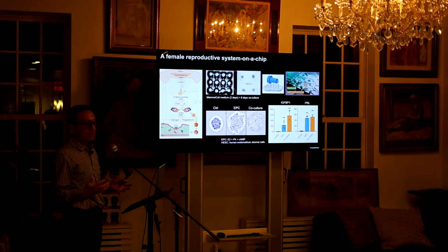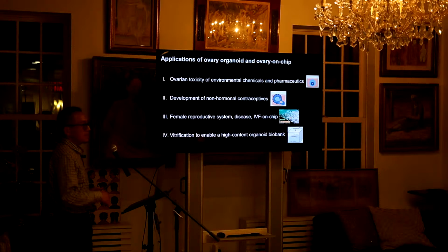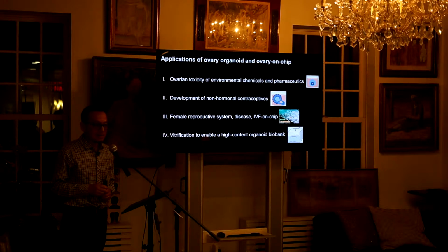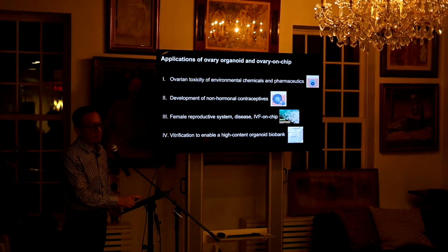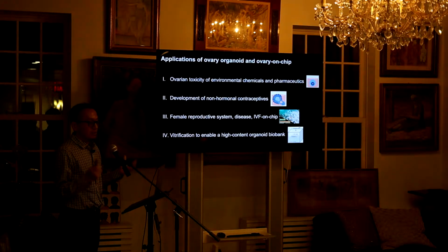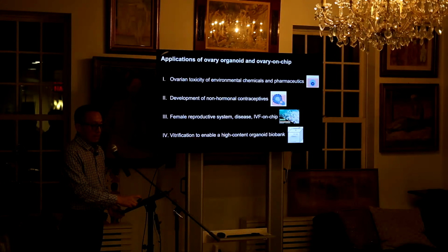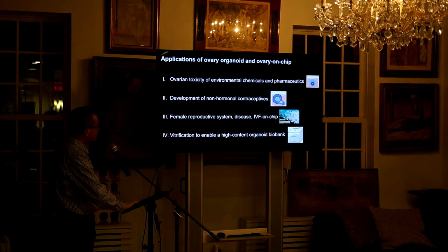We have a lot more data, but these are unpublished, so we are still working on the paper, and due to the time, I don't have time to show it. For example, we also did sequencing and other in-depth analysis, and we also use this model for toxicology research too. Our long-term goal is to build a really human cell-based female reproductive system on chip to study IVF, reproductive disease, and also toxicology as well.